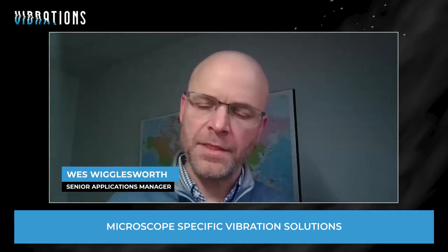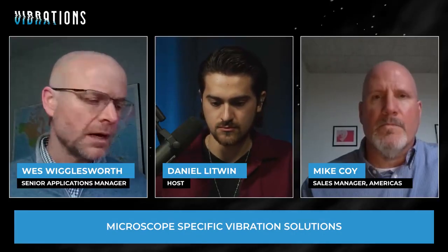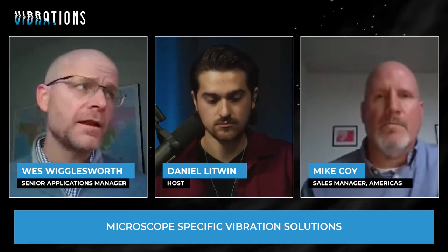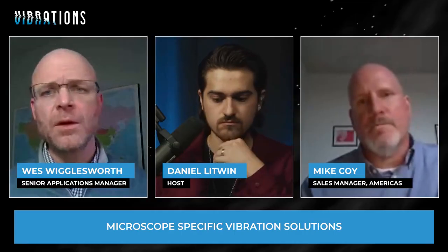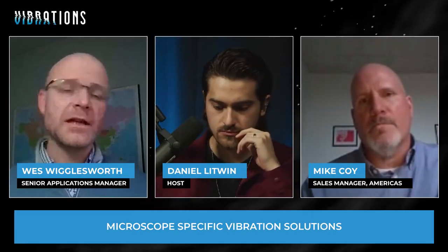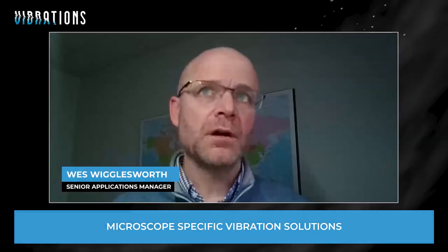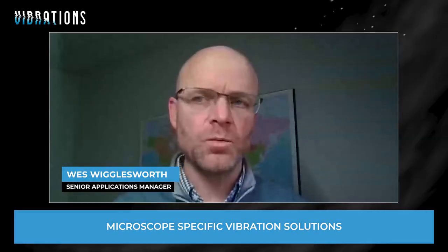So as the letters go up in the alphabet, that equates to a much quieter environment in terms of vibration. Mike mentioned earlier that the manufacturers survey the environments. They want to make sure the environment is good. And that's really the key, is going in to measure the floor vibration of the facility where these microscopes will be installed. And using the right kind of equipment to do that.